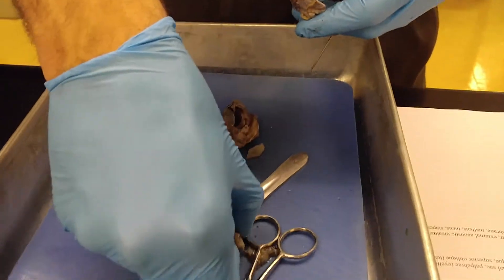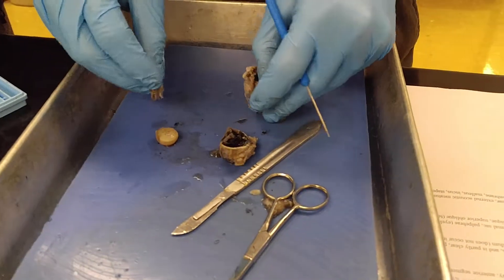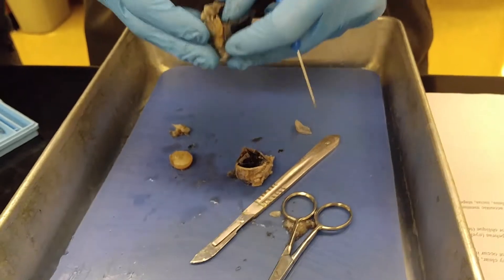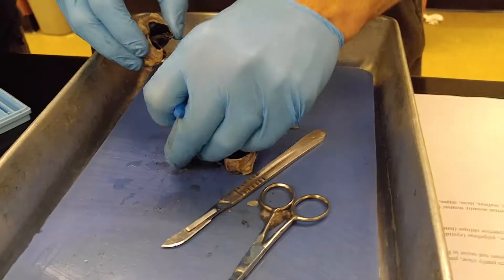The anterior segment and posterior segment we're not going to cover because the lens is right here, and that's what separates the two. The vitreous humor would have been any jelly-like stuff that remained. This is the lens.